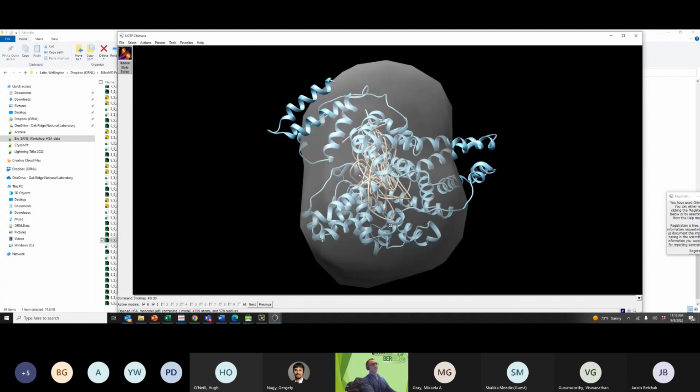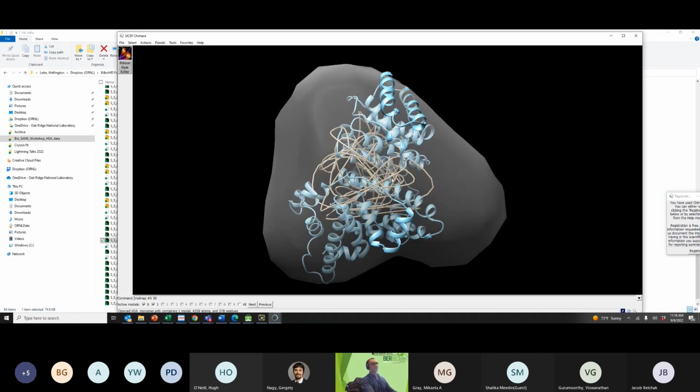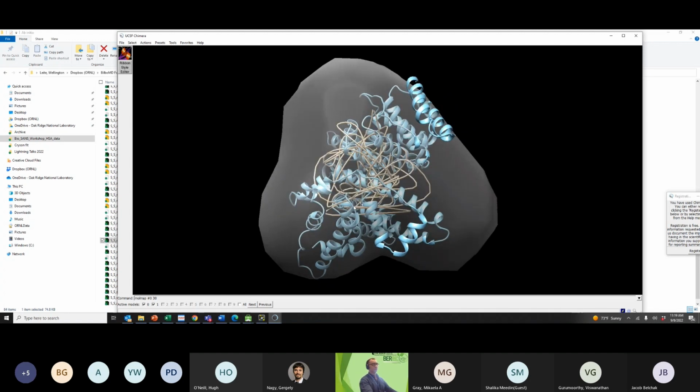...does not really show any agreement between what we expect to see, the conformation of the crystal structure, with my bead model structure that I'm calculating, right? So you need to do one superposition, the right superposition of our structure to our data.